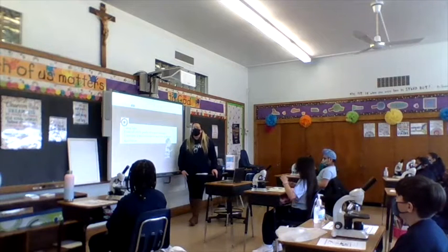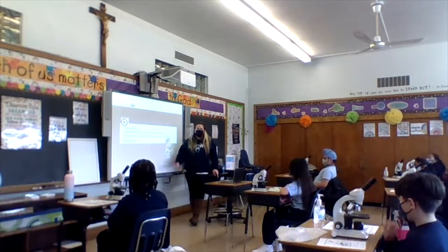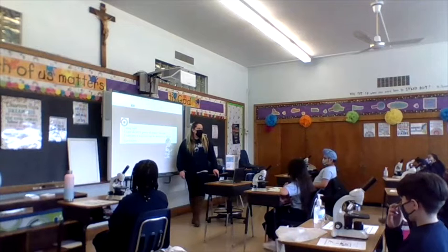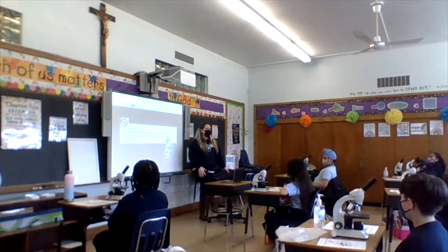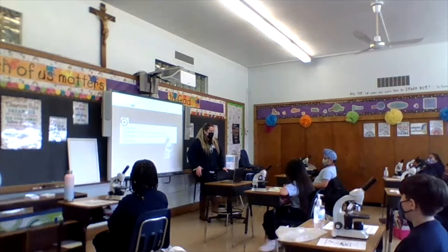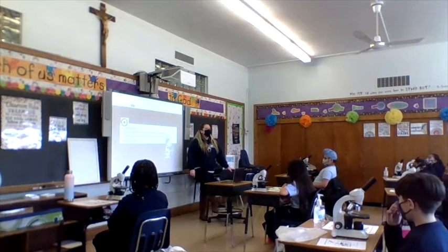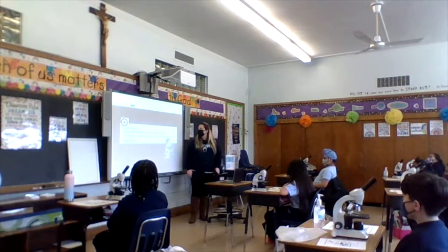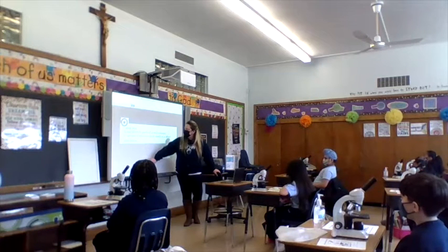Your second target, after we identify the parts, you're going to analyze a plant specimen. Say analyze. Who can raise a quiet hand and tell me what analyze means? Zio? To observe, to look closely, right? So you're going to look closely at a plant specimen because we're learning about photosynthesis. That's what we'll do after we identify parts of the microscope.